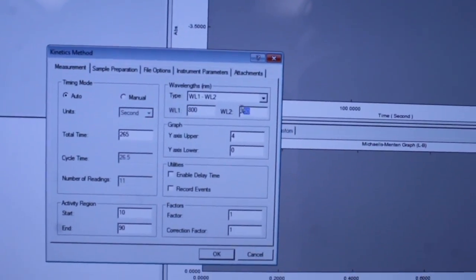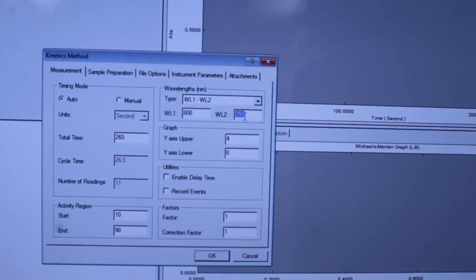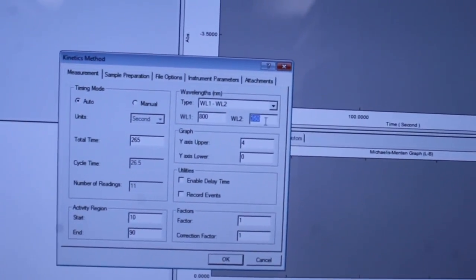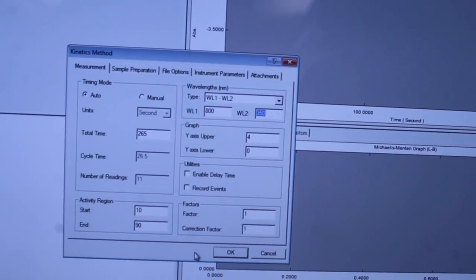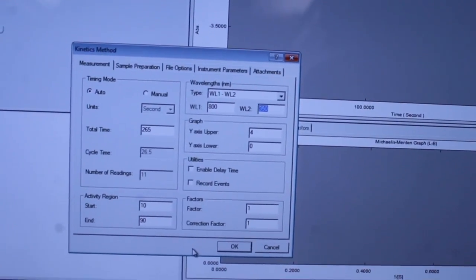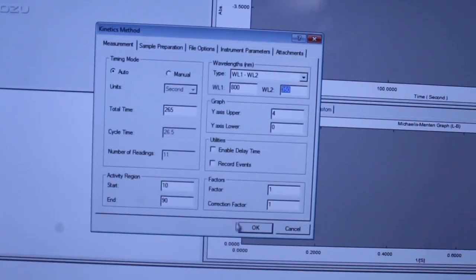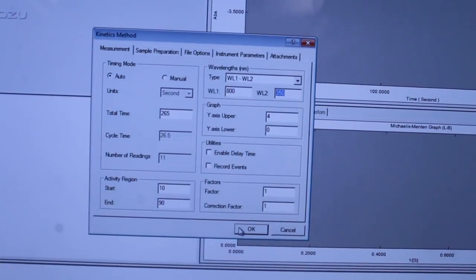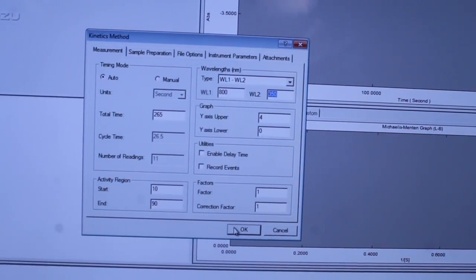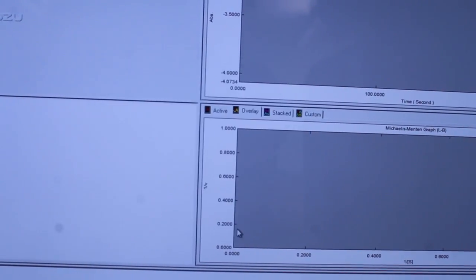For this demonstration, our desired range is 800 nm to 350 nm. Click OK.